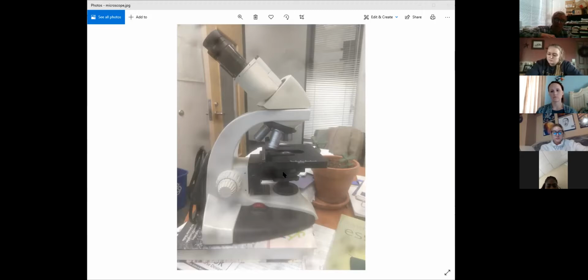So this is something that any photographer that uses a single lens reflex knows. The higher the f-stop, the greater your depth of field. So this helps with focusing as well. If you look through a smaller opening. Okay.